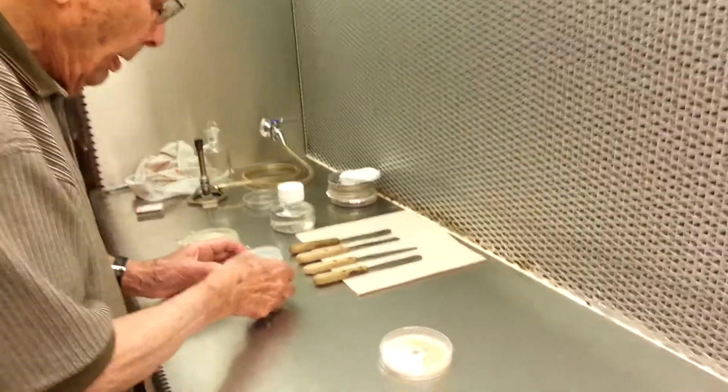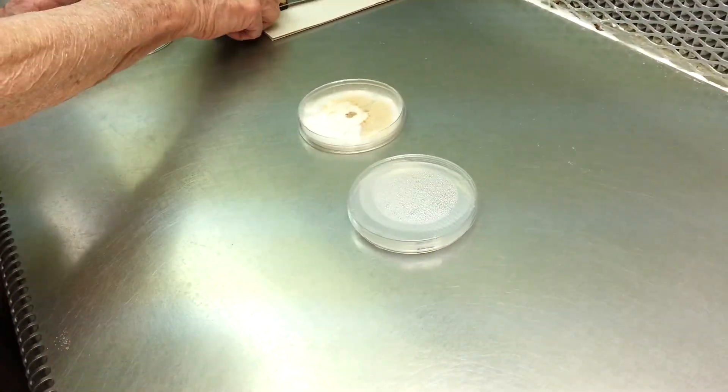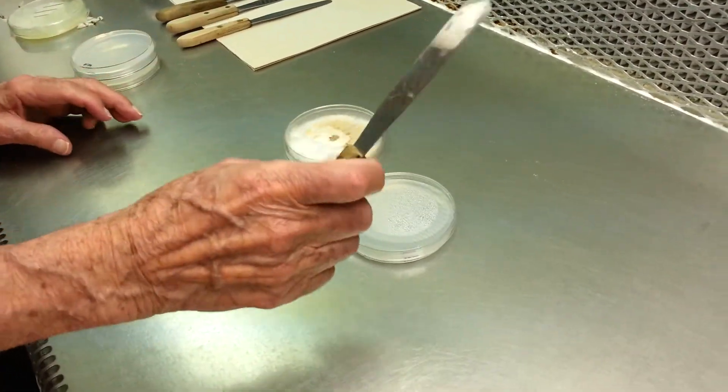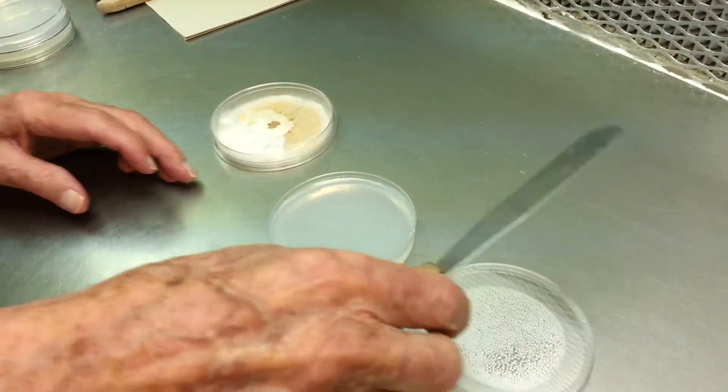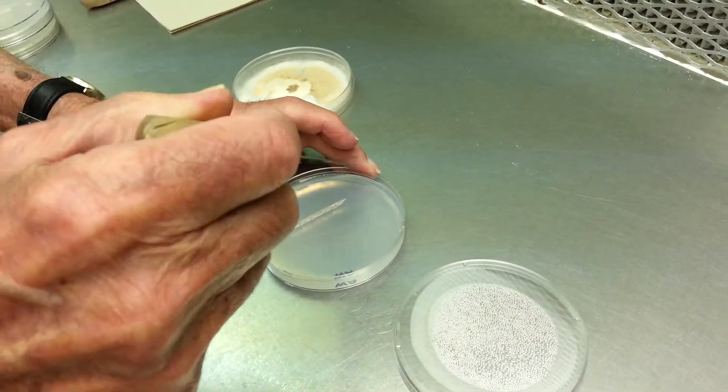Okay. Now the water agar method: take a dish that has water agar in it, and we cut out a block.